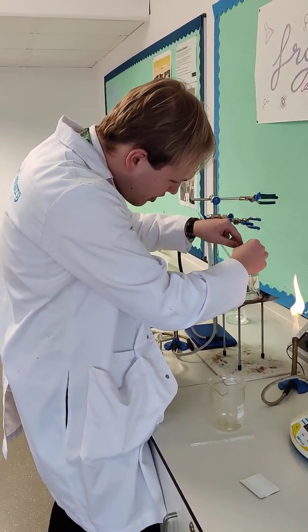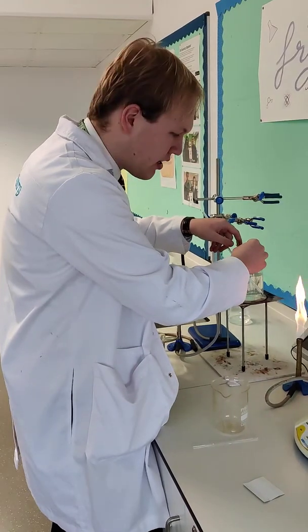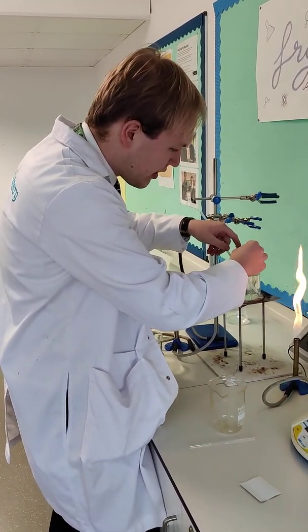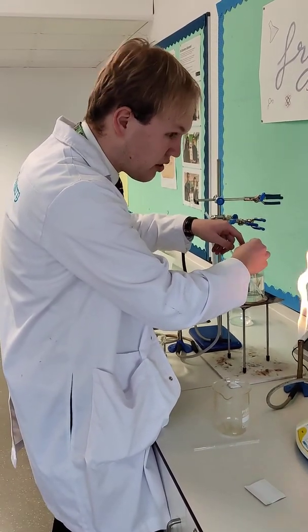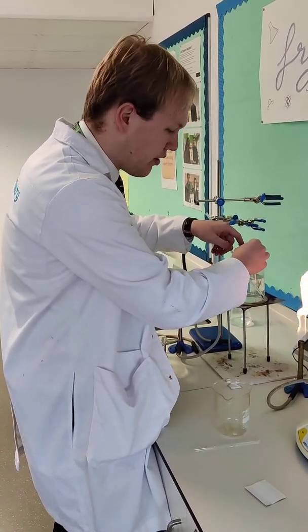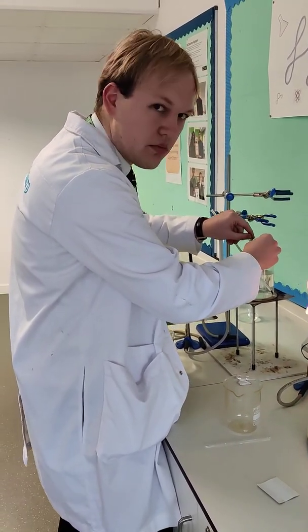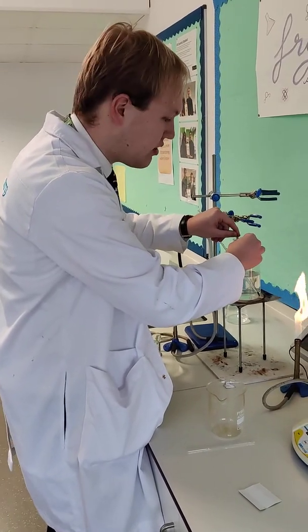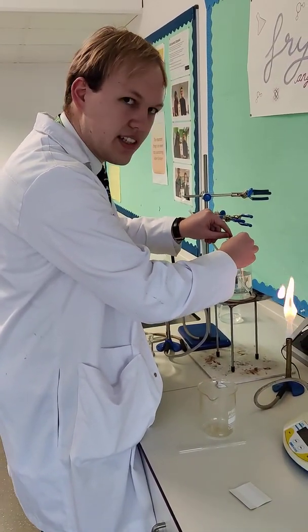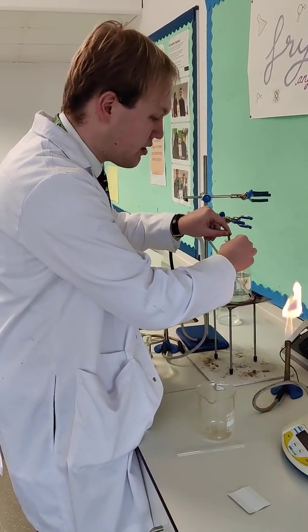As a side note, recrystallisation is quite a fine art, because we need to find a solvent that can, at a high temperature, dissolve the product as well as the impurities. You've been told today to use ethanol, but sometimes you might not be told. At university, you're just asked to recrystallise your crude product — you might have to test different types of solvents, and sometimes even different combinations of solvents.